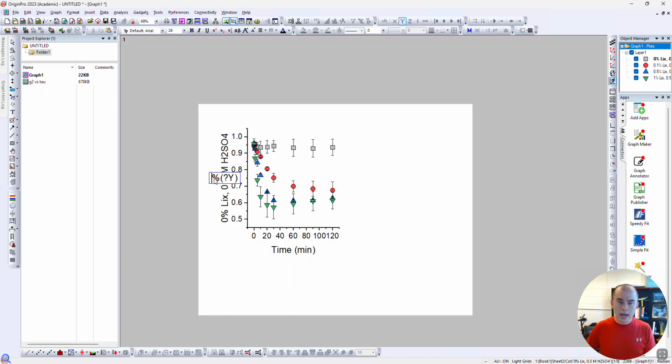All right, so the y-axis here we had as being Cu2+ millimolar. So I'm just going to do this directly in, and then I want this to be superscript, so I'm going to just change it to superscript at the top. Great, so that's the y-axis, and the x-axis looks fine already.